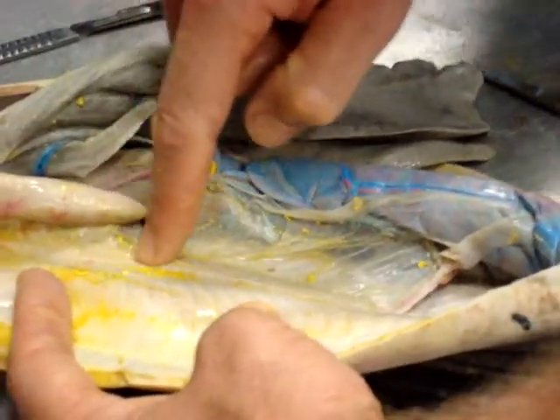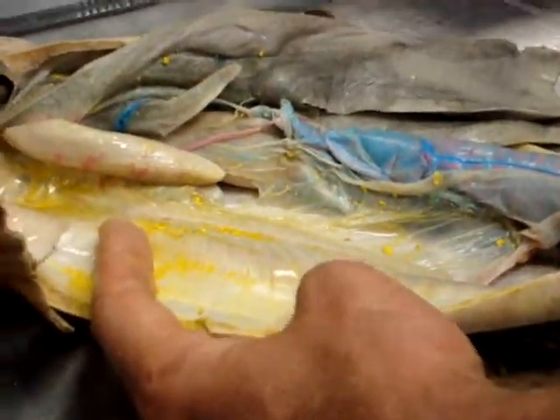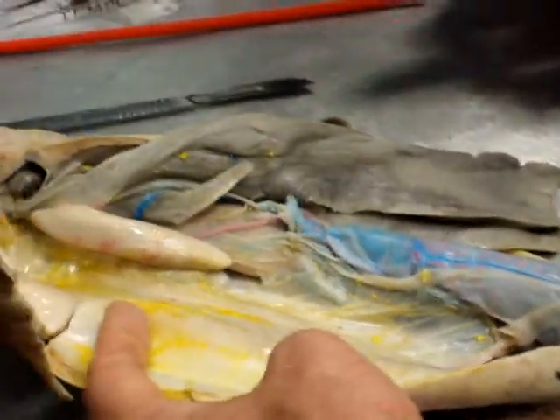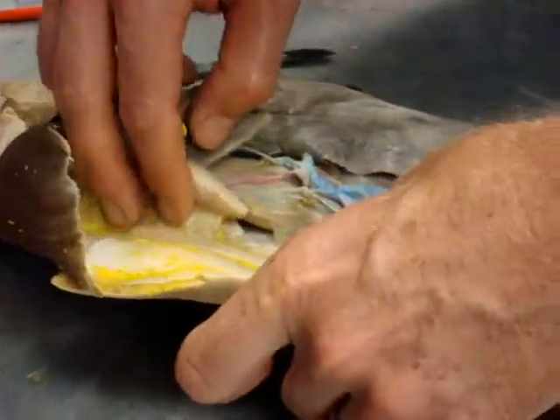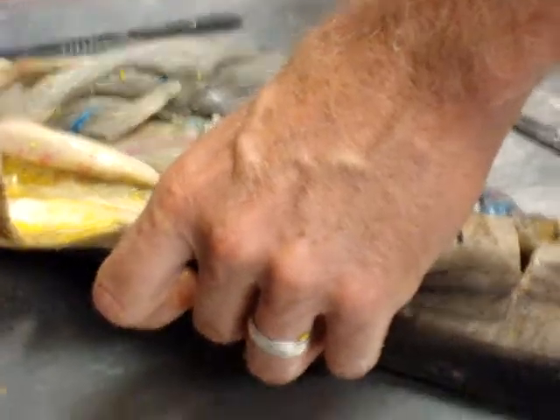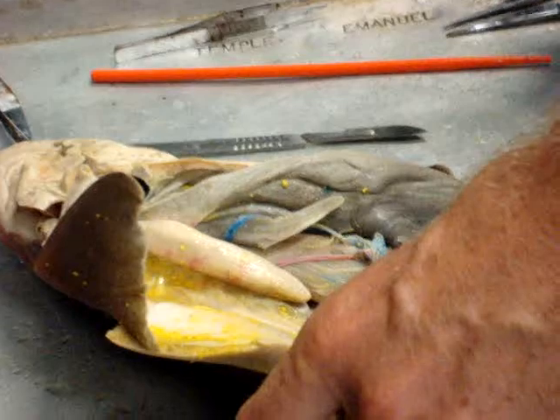Wow, so it's like a jelly. Is it this line coming out of that thing? The wiggly line? No, that's probably part of the gallbladder, the duct into the stomach from the gallbladder. There is no kidney thing on here then. No, some of the stuff might not be labeled, that's fine. Why is it all wavy, like a worm in there? Flattened, ribbon-like, darkly colored. Yep.